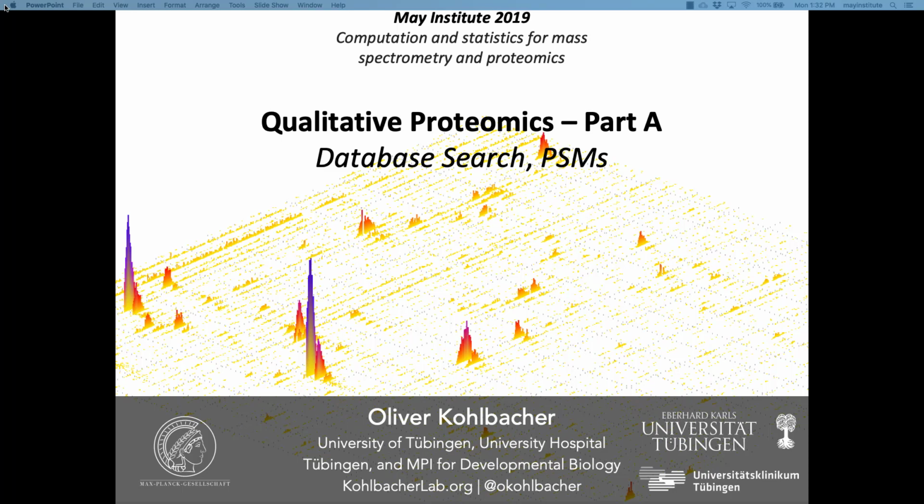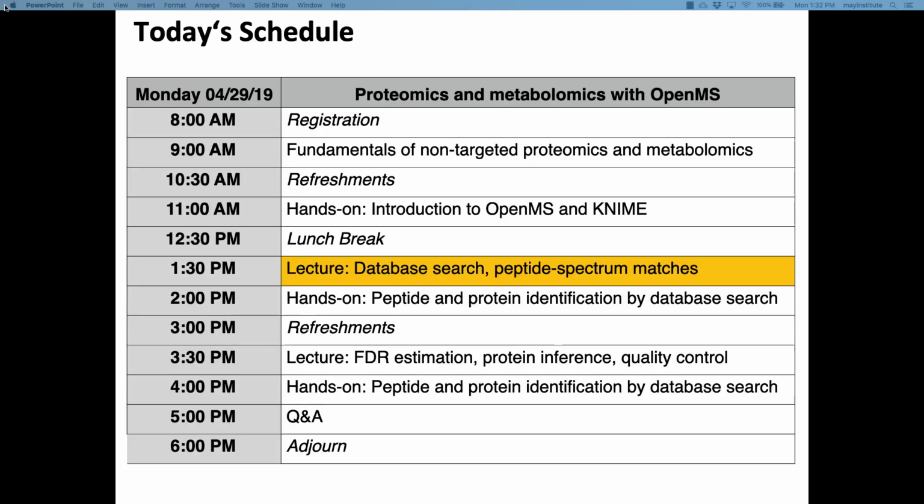I would just like to get you started with the real content of this course, and we need to talk about proteins, so we do some proteomics this afternoon. What I'm going to do now is give you a very rough, very short outline of how we can actually sequence proteins or identify proteins.